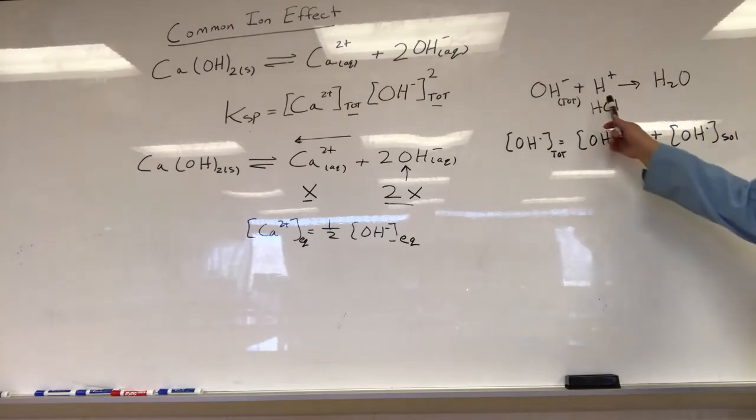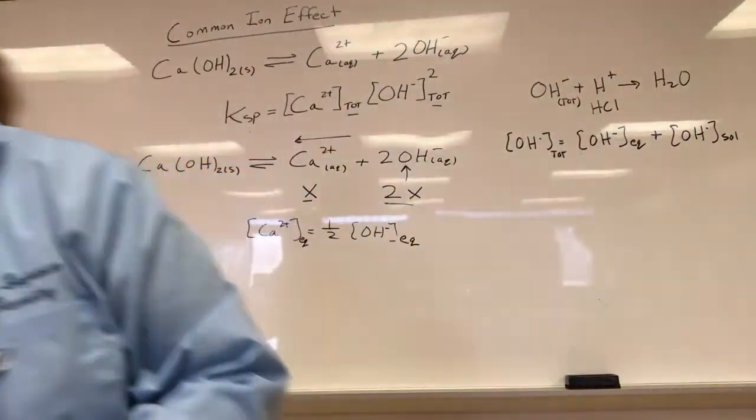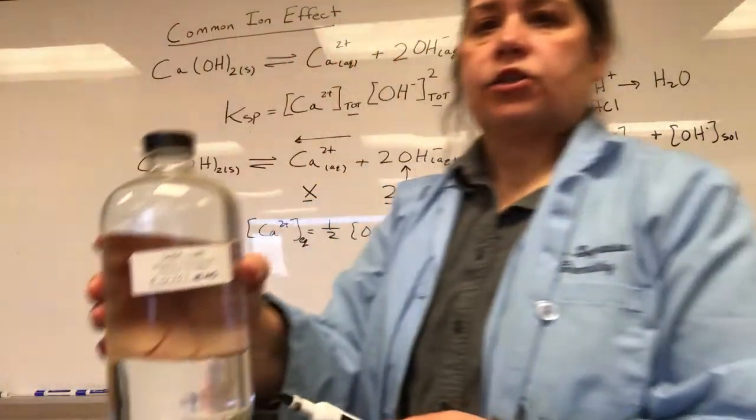Okay, when we neutralize it with hydrochloric acid, we're going to be measuring the total. Now, the hydrochloric acid we're going to use has this concentration here.